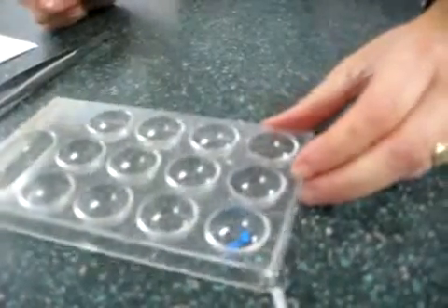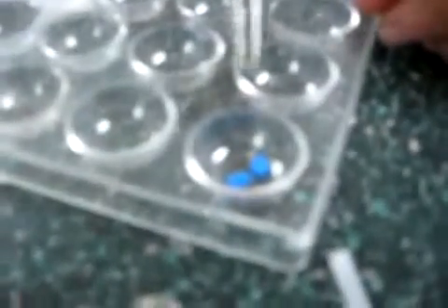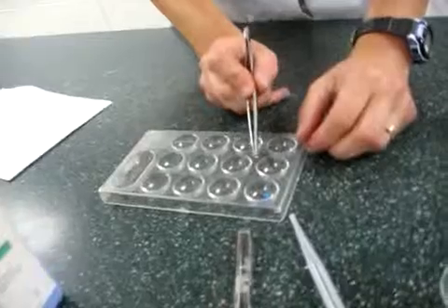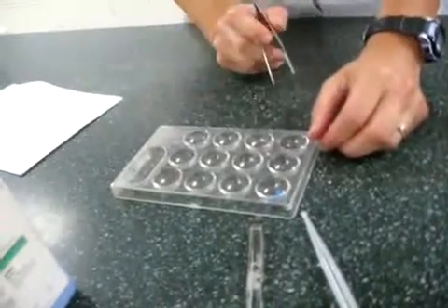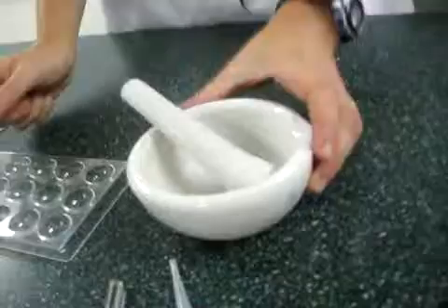The next thing you will do is observe your samples, and you will record the color, you will record the texture, and by texture we mean, is it crystal or is it powder? You will record the luster, and after you have done that for each of the 4 samples, you are ready to begin the tests. The first test you will do is a test for brittleness.